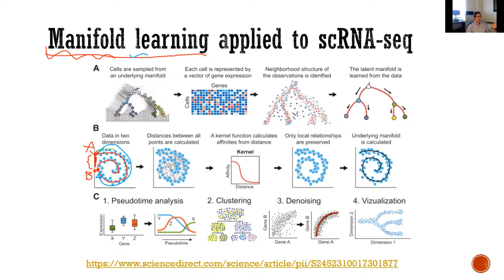You define a number K. If you define K as 5, then you only find the 5 nearest neighbors and connect to them. So in that case, you create the KNN, and you learn the structure from the network.